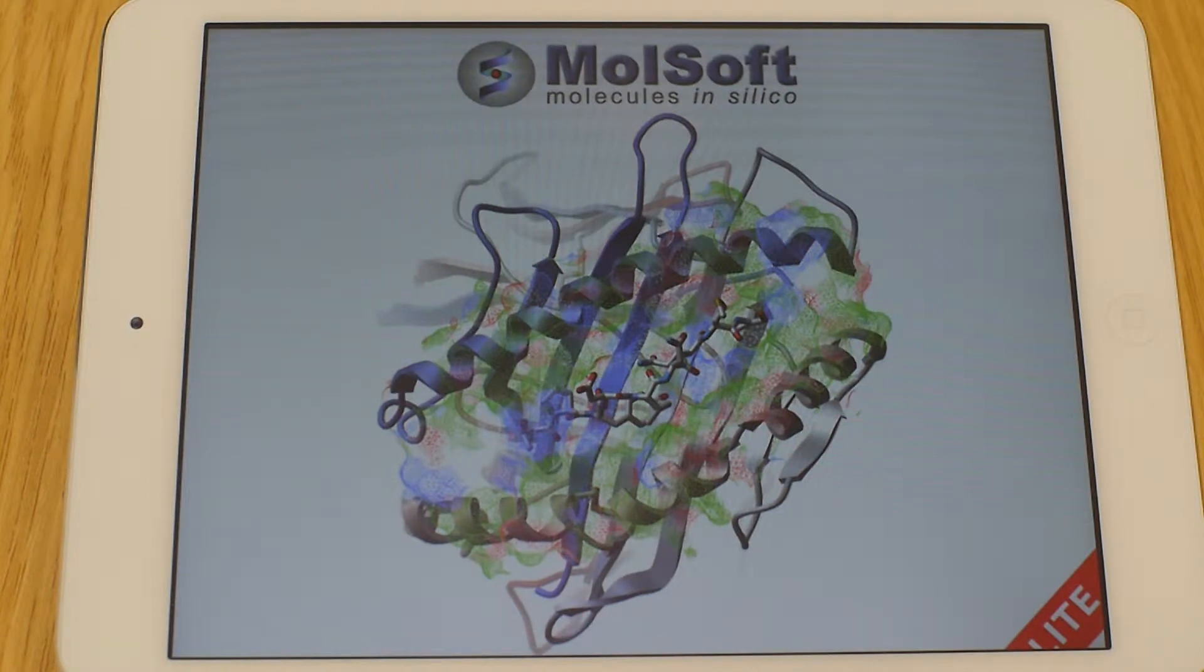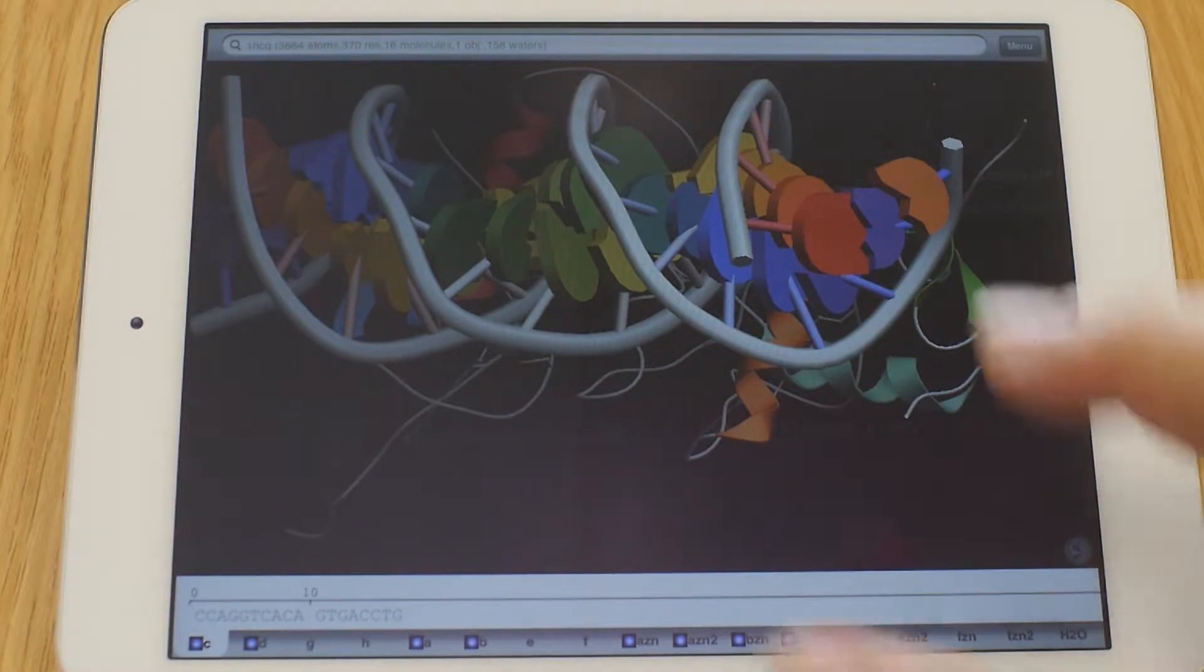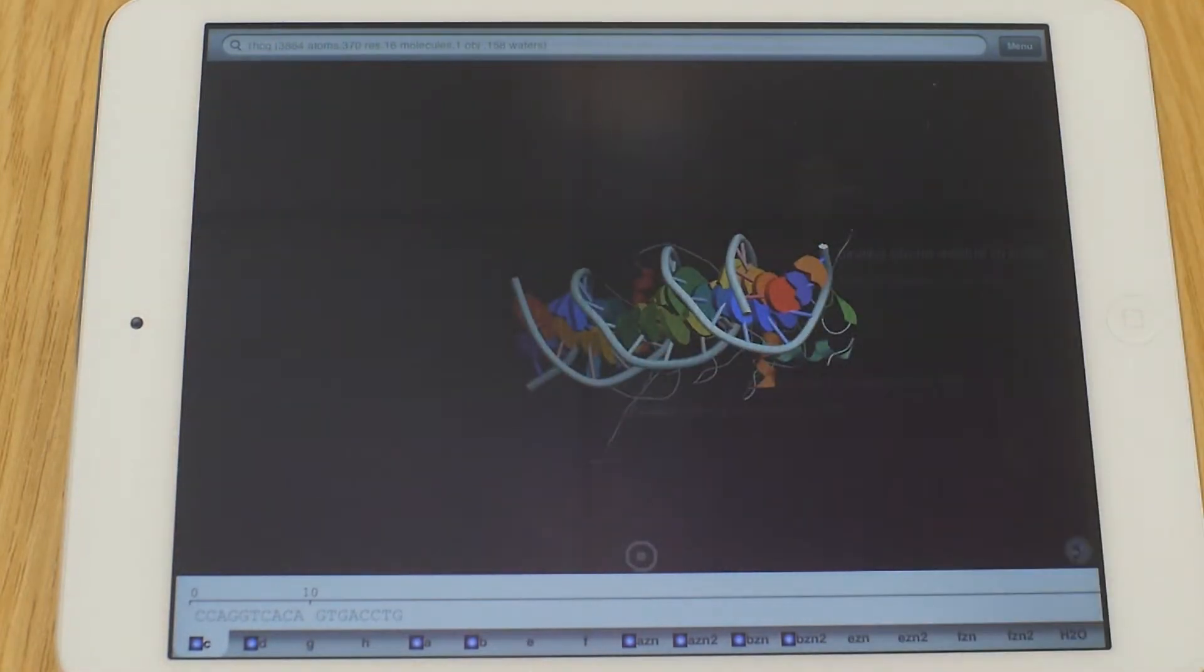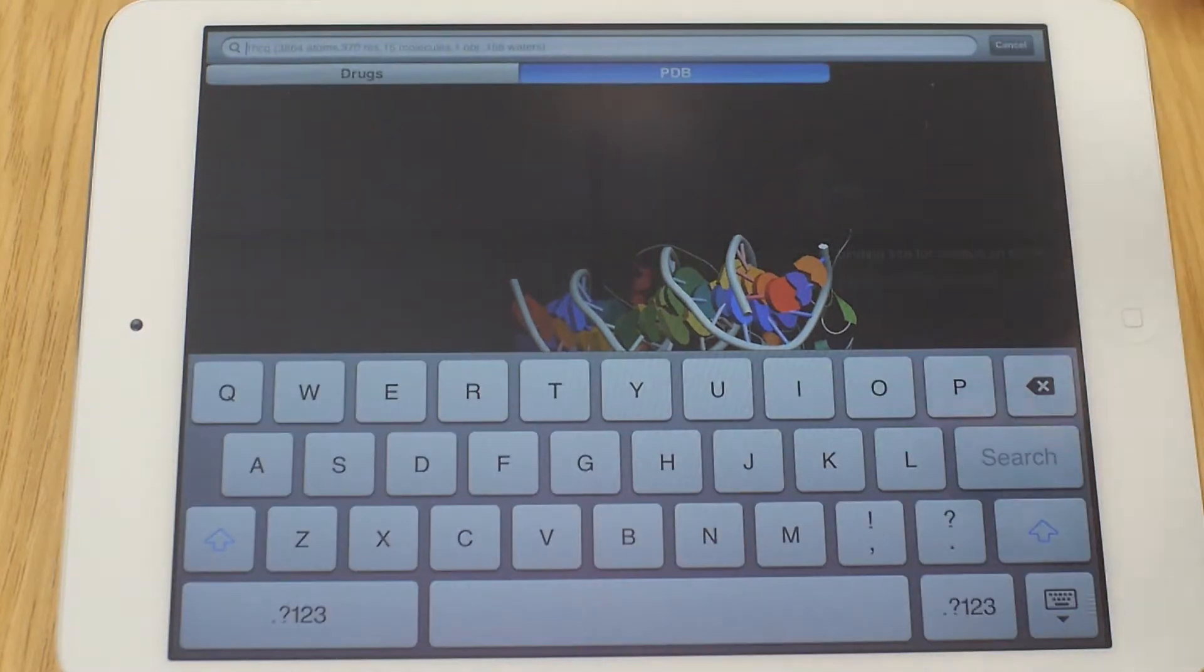If you click on it, it will start up with a default protein. Now this is the last protein I looked at. But let's start with another one. You just click on this field and then you type in which of the molecules you want to work on. It will search them in the PDB database straight away, which is the same database that you can use to retrieve other sequence information data files. This might come in very handy.